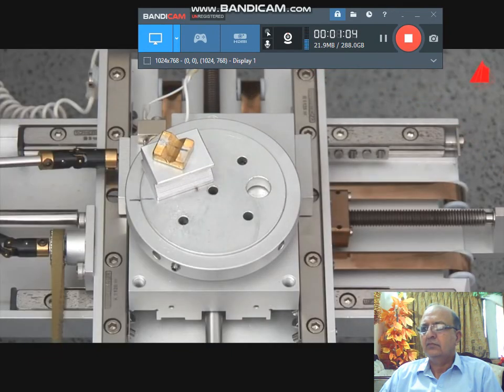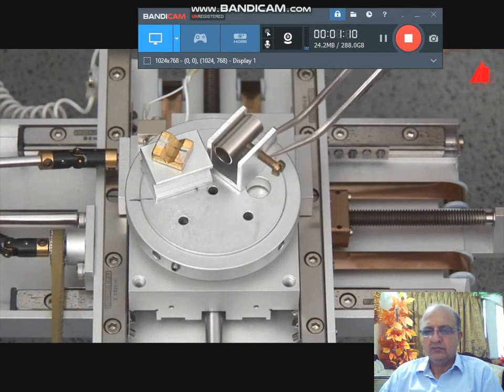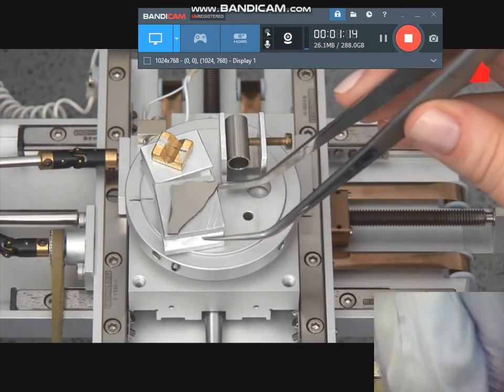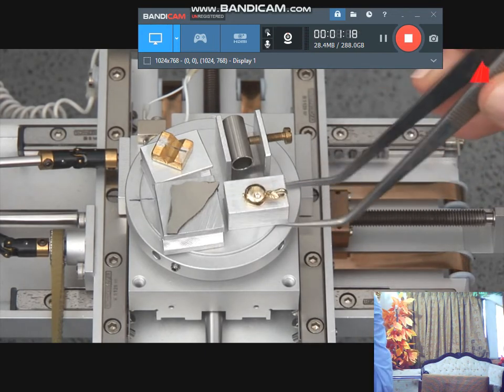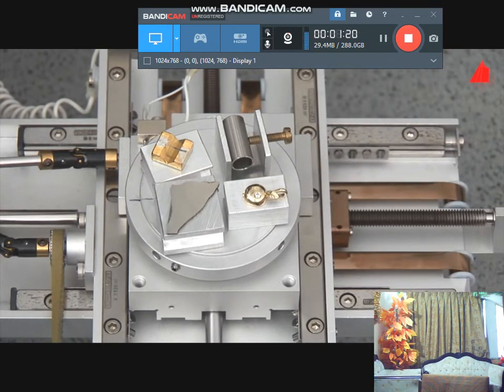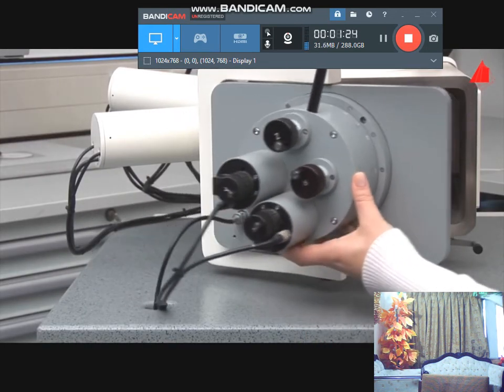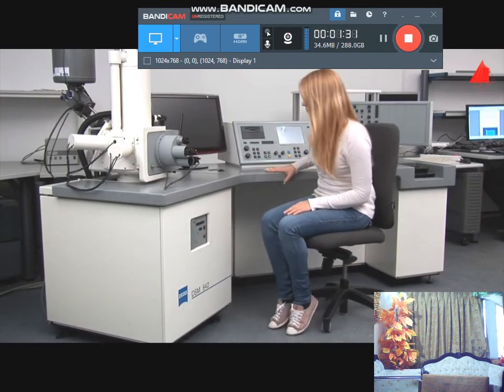The filament of an old used light bulb, part of a welded tube on a sample holder, a small cobalt plate, and a golden piece of jewelry. All specimens are assembled and we are ready to start. The material tester carefully closes the cover plate and switches on the two-stage high vacuum pump as well as the electronic control.